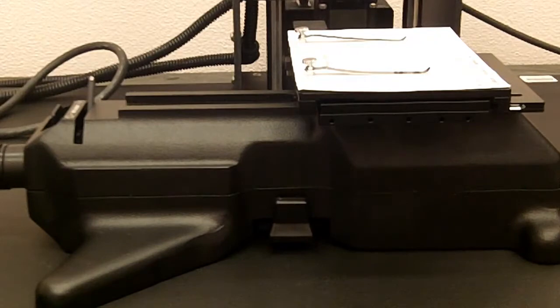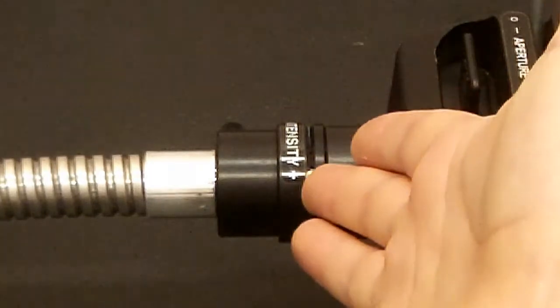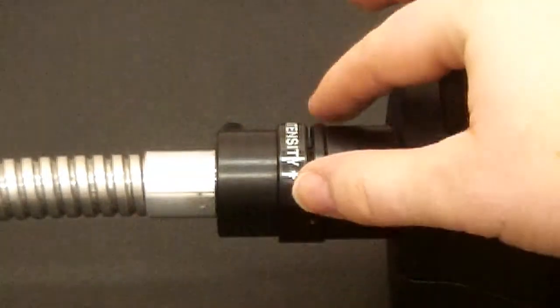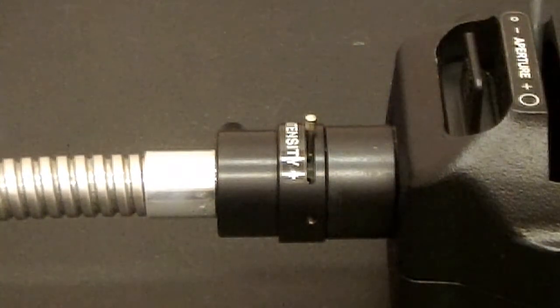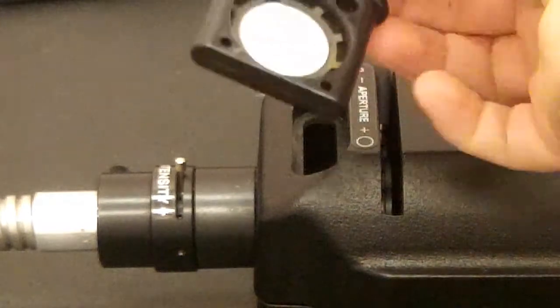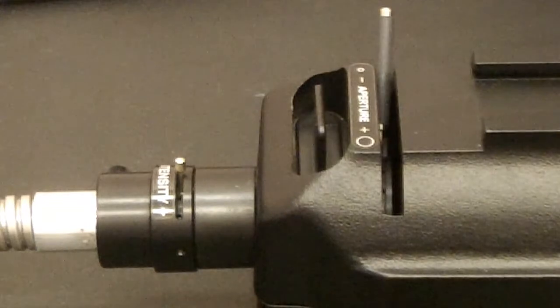So now let's go over other components of the SolMate. On the intensity control, you can see closer to you is a plus sign, so light is more intense closer to you, and as you push the dial farther away, the light will become less intense on the specimen. Next to the intensity control is a light filter, which, if in, will allow for more diffuse, less intense light, so you can either leave it in or out depending on what you're working with.